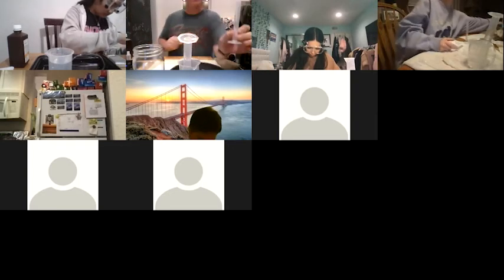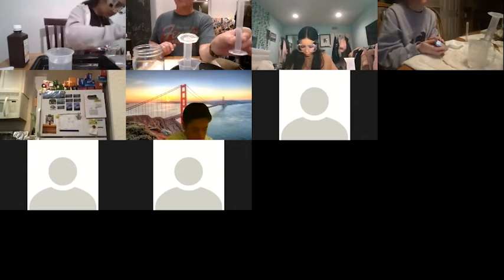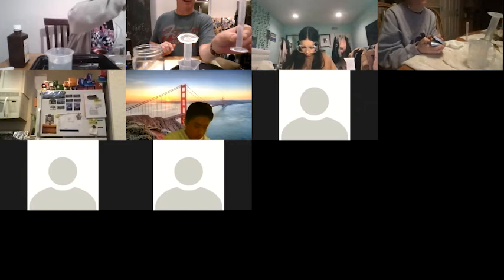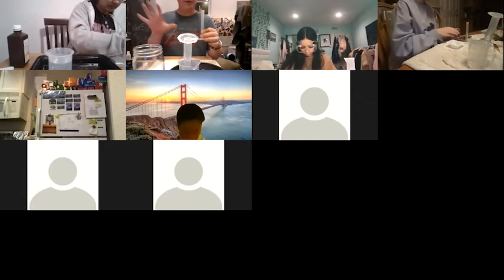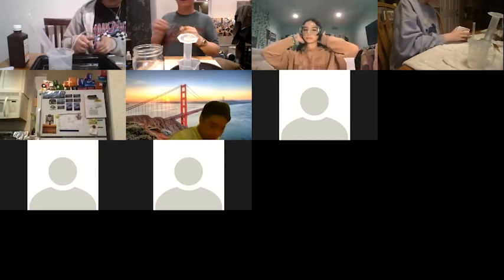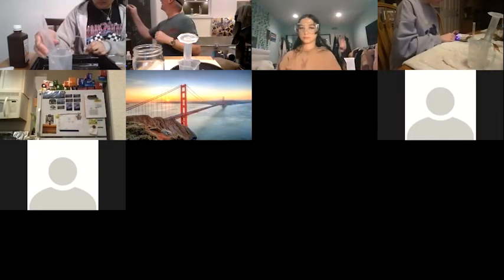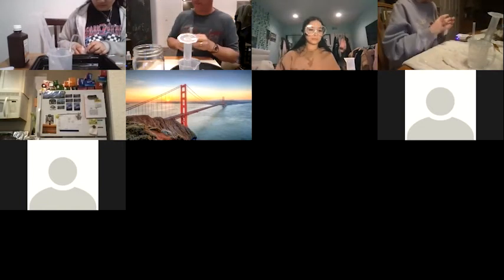Yeah, it really helps you when you're trying to read the volume of these. If you could hold them against a dark surface, it makes it much easier to read. Because man, I've got all this white surrounding me and I'm trying to read white numbers. It's really hard. But if you have a black surface like I've got behind me, it makes it so much easier. 9.6.